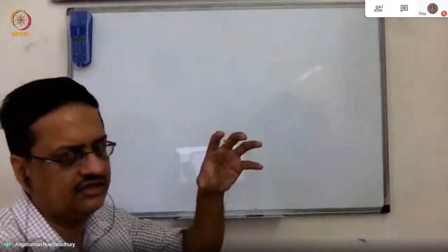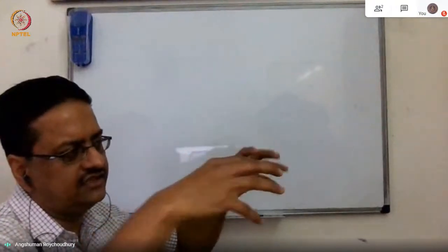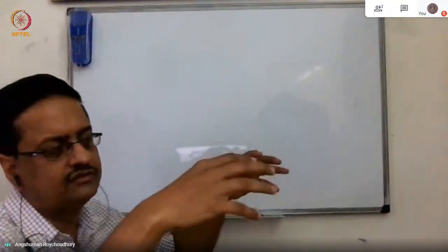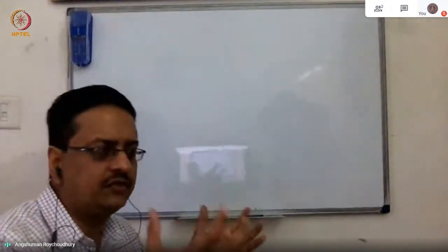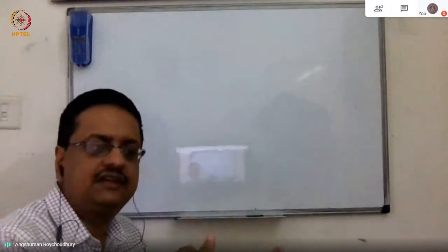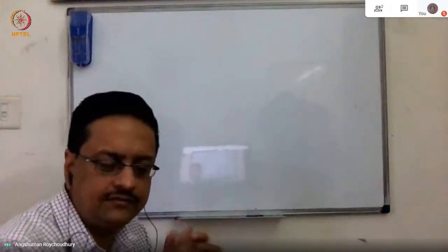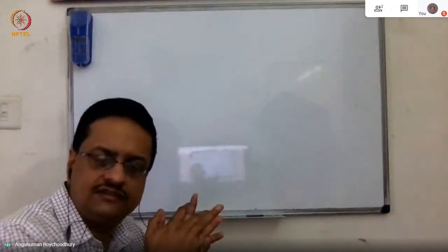Suppose one molecule is here and another molecule is here. How is the electron density distributed between the two molecules, which may be bonded by hydrogen bonds, van der Waals interactions, or some other interactions, including CHF interactions or halogen-halogen interactions?